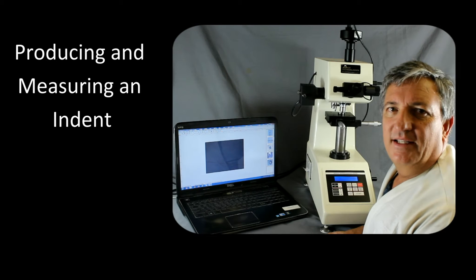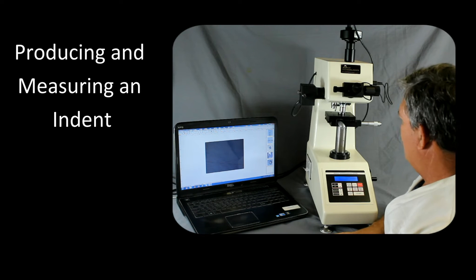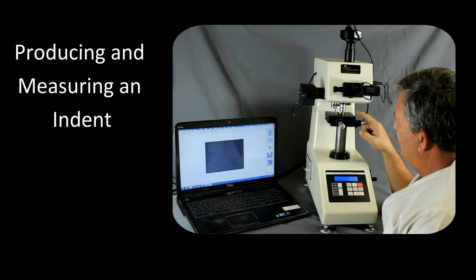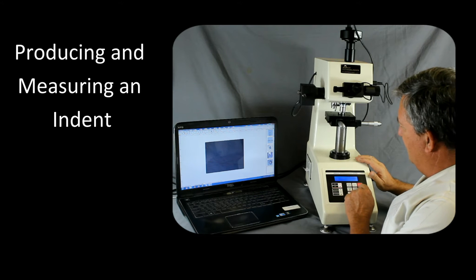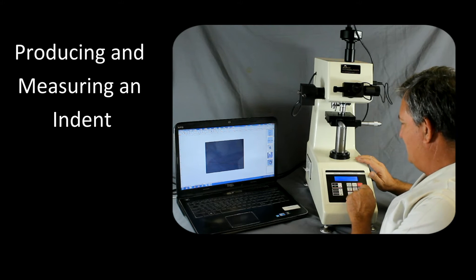To make a measurement on the HV1000Z, first we need to focus on the sample. Right now it's set to the 40x objective, which with a little practice you could probably use. But if you haven't worked with the hardness tester much before, you probably want to rotate over to the 10x — it will be a lot easier to see the sample.